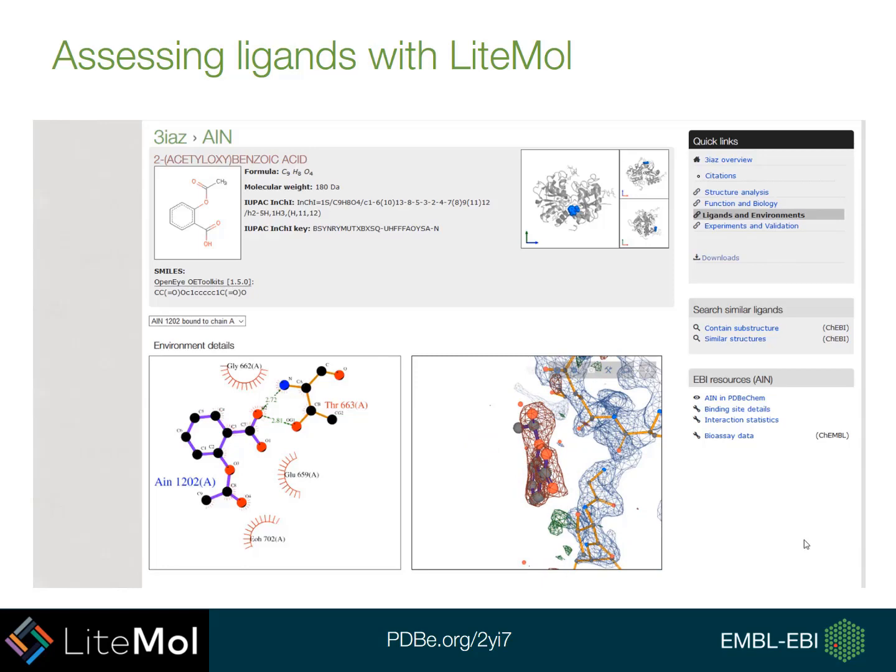If you look at ligands through our pages, you can get a good idea of how well what you're looking at fits the validation. You can then have some confidence in what you're looking at.